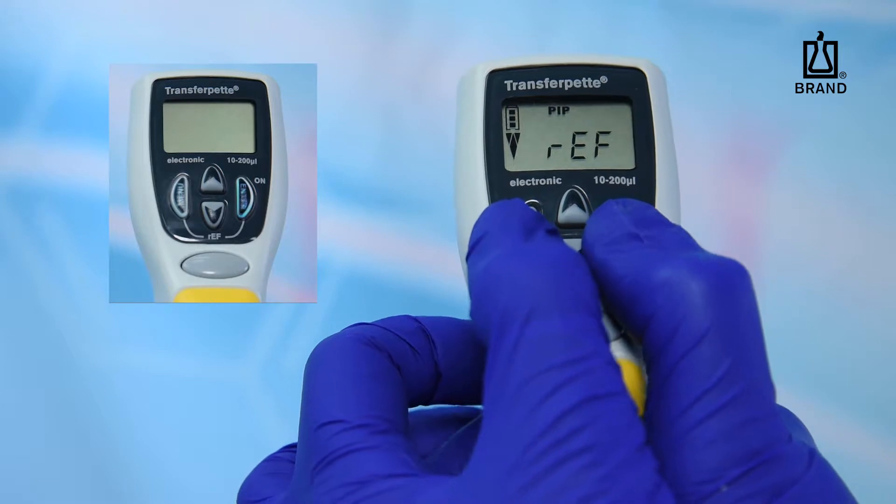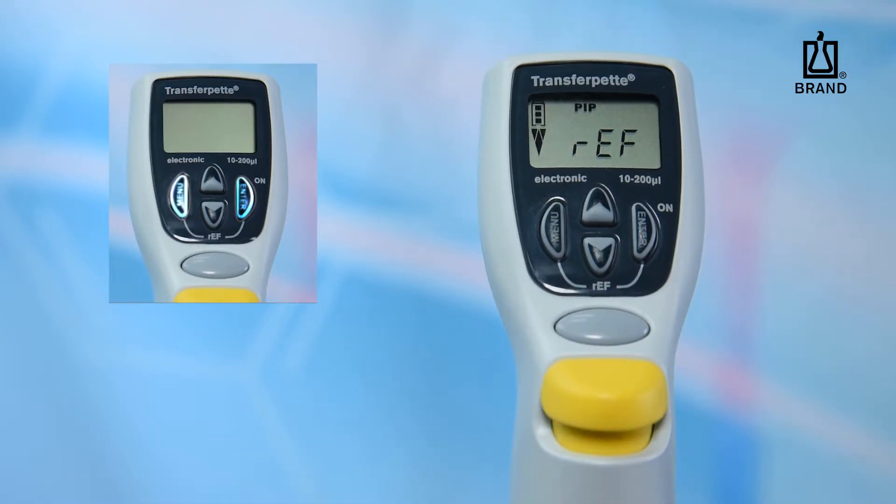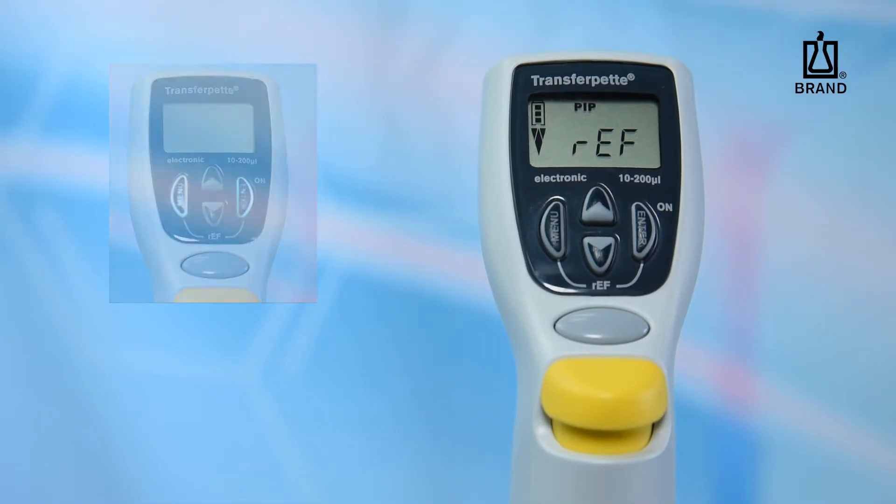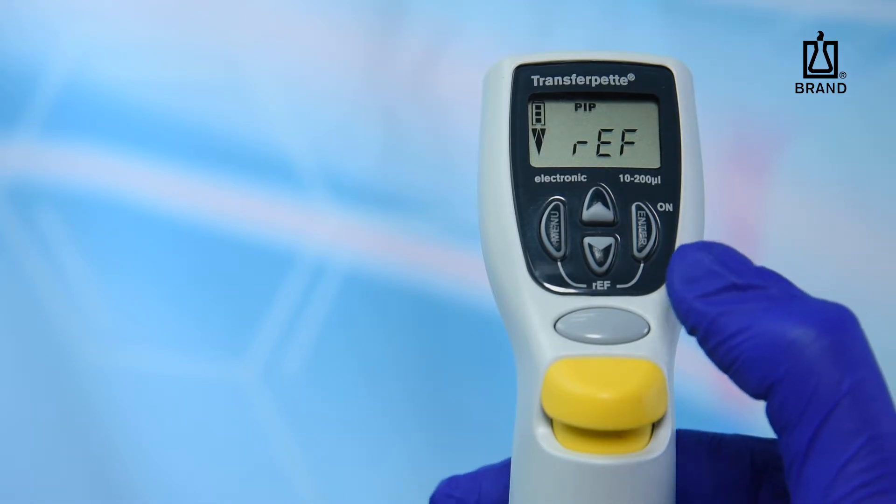To perform a reference movement, simultaneously press the menu and the enter keys. Ref should appear on the screen. Press the pipetting key to start the reference movement.